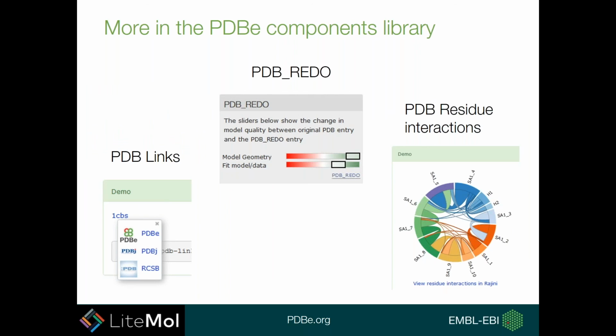For instance, the PDB links on the left-hand side. If you want to put a link out or want to offer people the chance to choose whichever of the PDB sites they wish, you can put this component in, and this will offer you a link to each of the websites from here. There's also a PDB-REDO component.